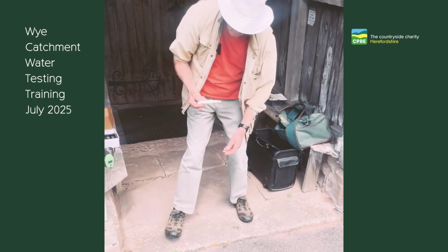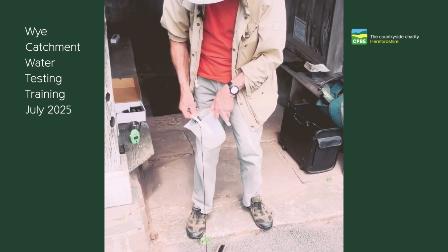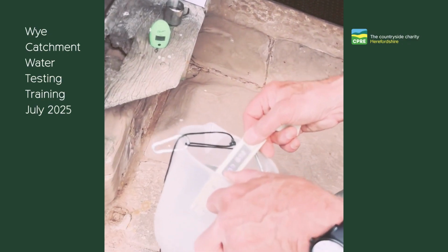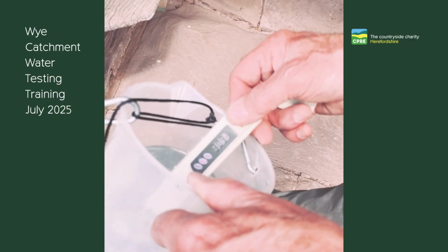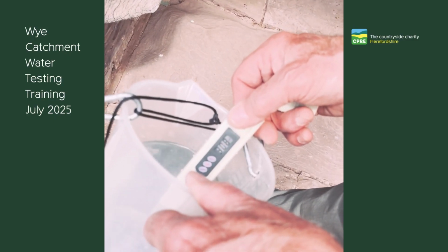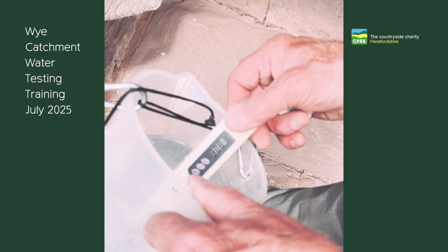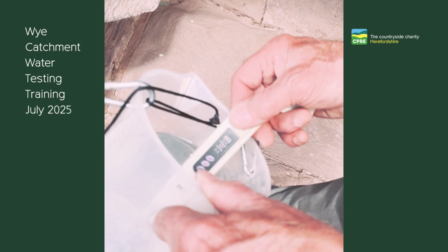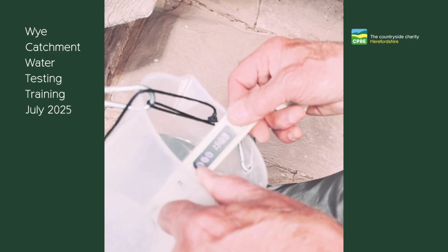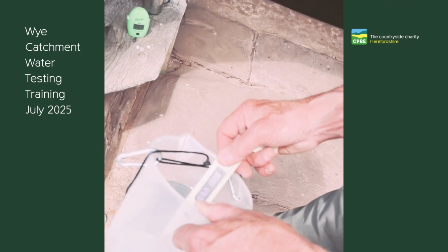sample, which is down here. I'll use the big jug for this. It's now delivering a reading, and you'll see that it's moving around a bit. It's necessary just to agitate the device slightly and leave it until the reading settles down. That's pretty stable now at 308. It's just gone to 307, 309, 308. So I would record that as a 308.